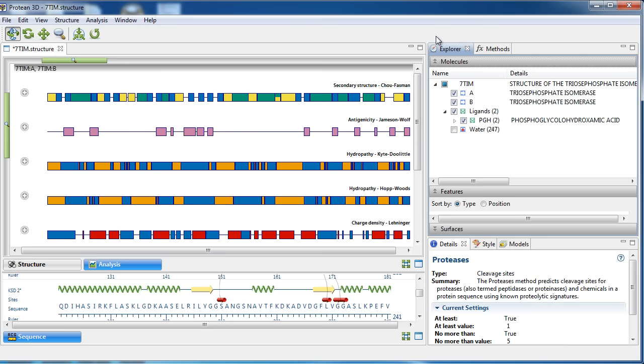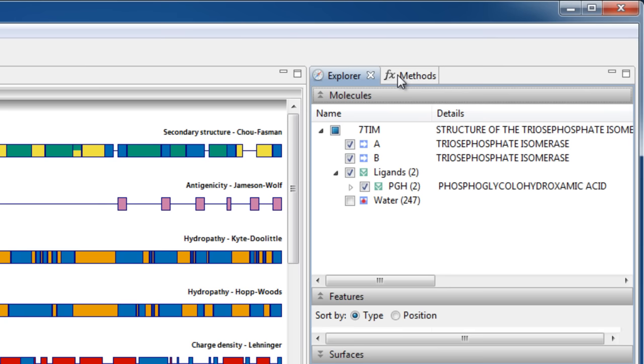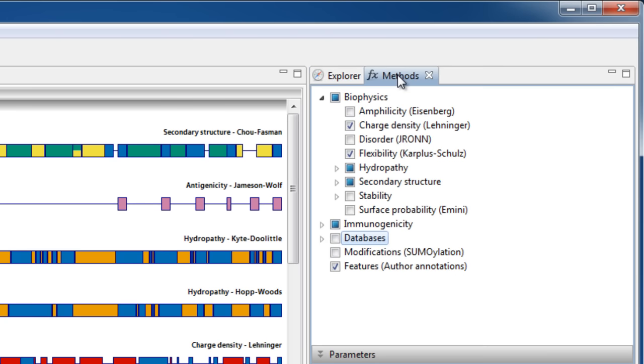Protean 3D allows you to predict cleavage sites for proteases. This prediction method can be accessed through the Methods panel.